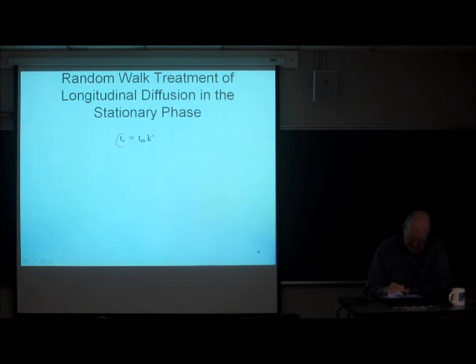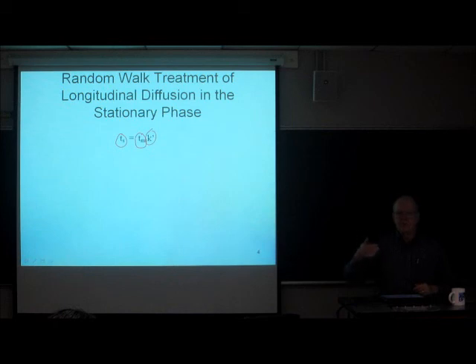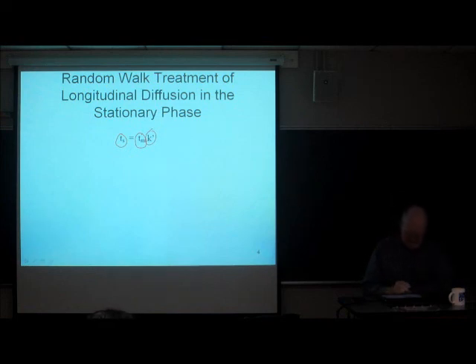The time that a molecule spends in the stationary phase is equal to the time that it spends in the mobile phase times the retention factor, k prime. If the retention factor is 0, it never goes in the stationary phase. It doesn't spend any time in the stationary phase. There's no diffusion in the stationary phase. But the more it's retained, the more time the solute spends in the stationary phase, the longer the time it has to diffuse in the stationary phase.